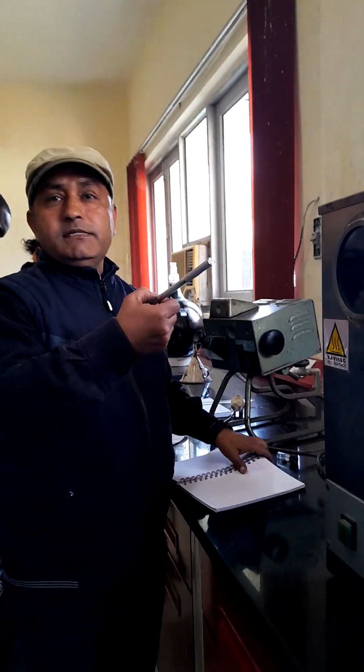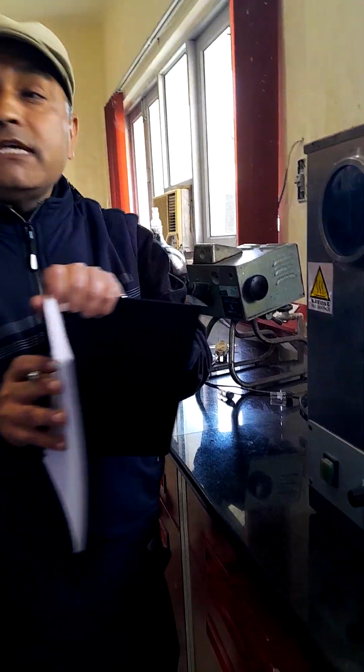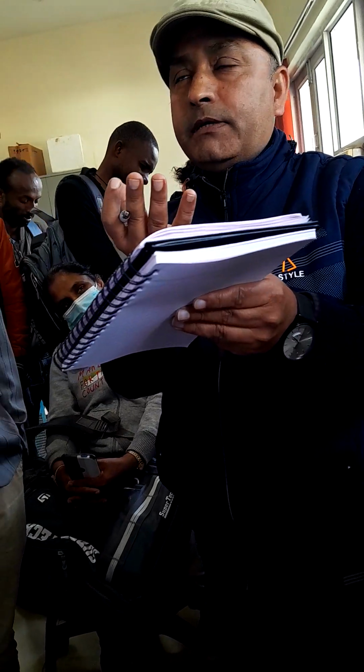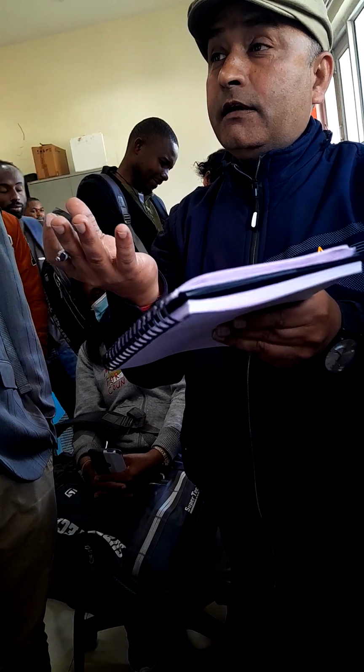Here, with commercial diesel, when we start D86 you will find the temperature interval between collecting 5% and 10% is 10 to 15 degrees centigrade.